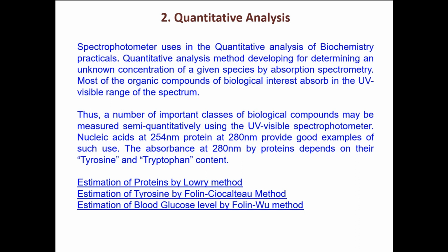So I'm going to use NADH concentration to characterize the enzyme activity. How can I do that? The reaction in the forward direction can be followed by measuring the increase in light absorption of the system at 540 nanometers in the spectrophotometer. Okay, let me check. It is 340 nanometers, right? It's only at 340 nanometers, not 540 nanometers. It is 340 nanometers.